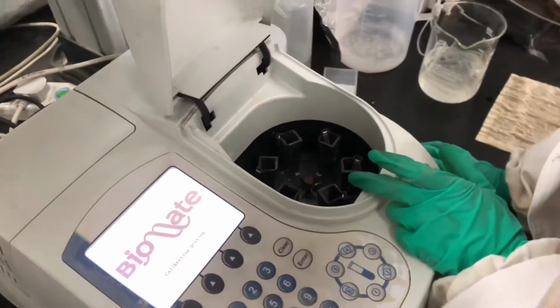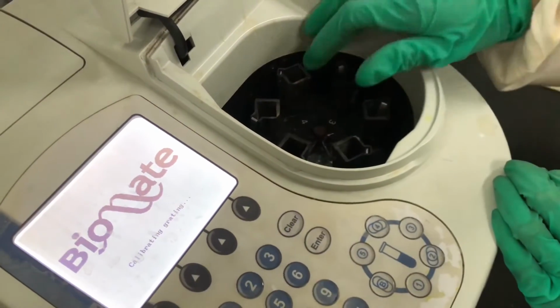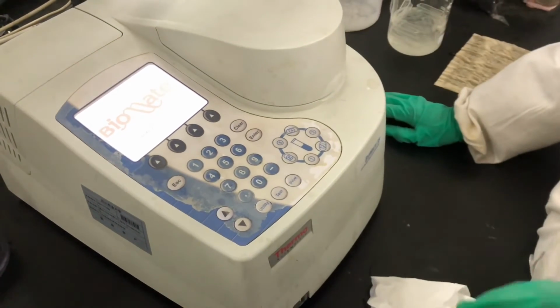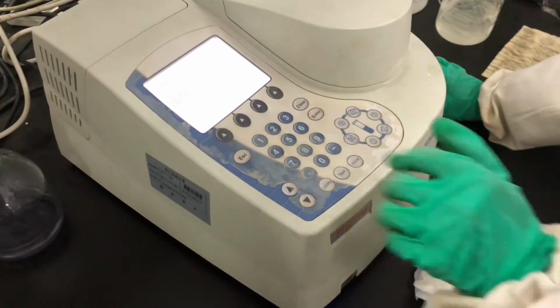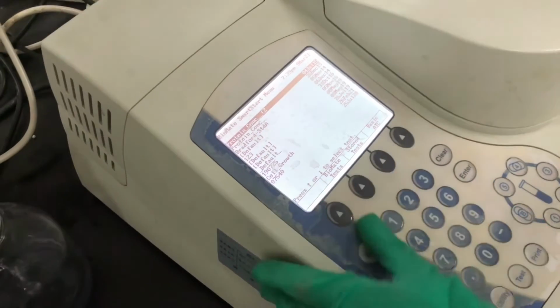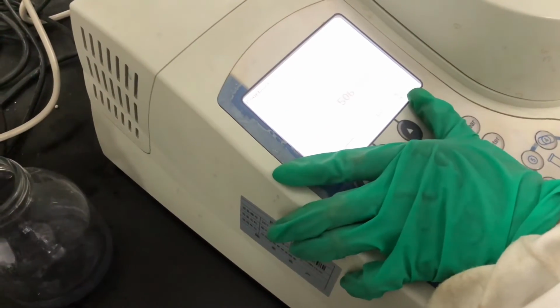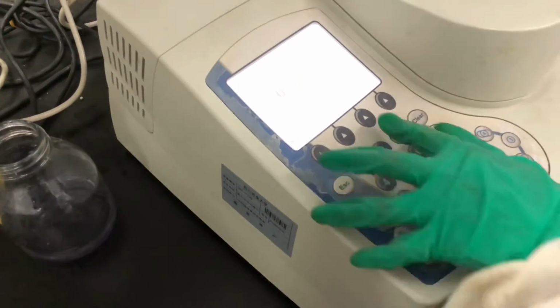Okay. This is blank. It's 1, 2, 3, 4, 5. Every time you can test five samples. Yeah. Okay. Wait. This is the. Okay, I know.